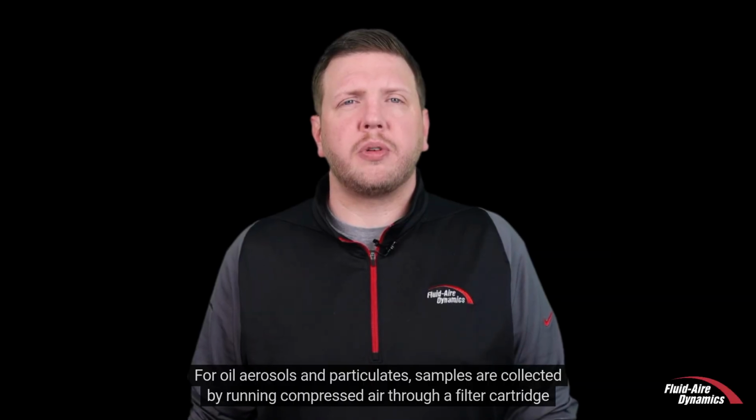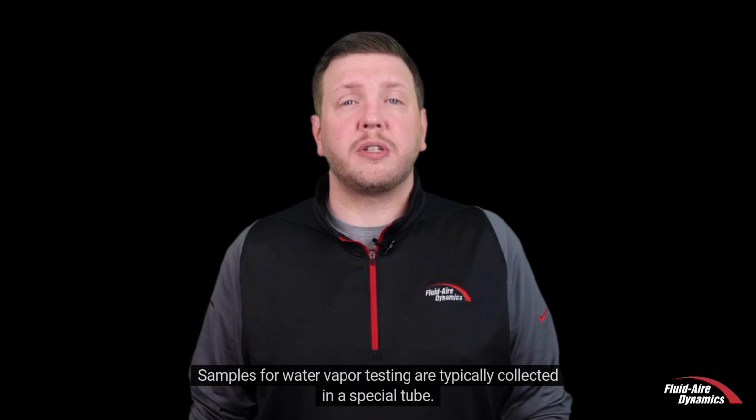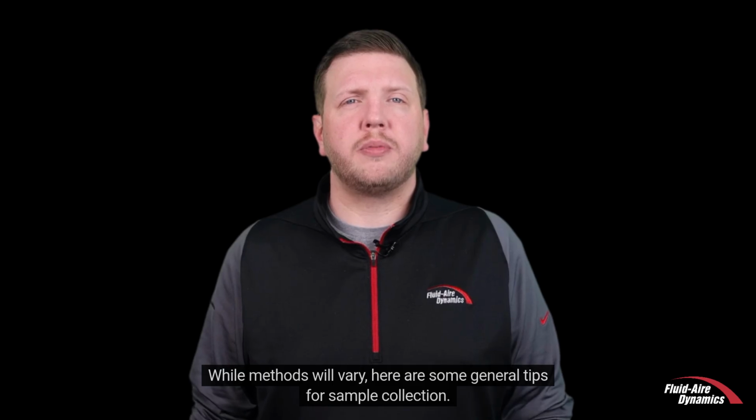For oil aerosols and particulates, samples are collected by running compressed air through a filter cartridge at a set flow rate for a set amount of time. Samples for water vapor testing are typically collected in a special tube. While methods will vary, here are some general tips for sample collection.